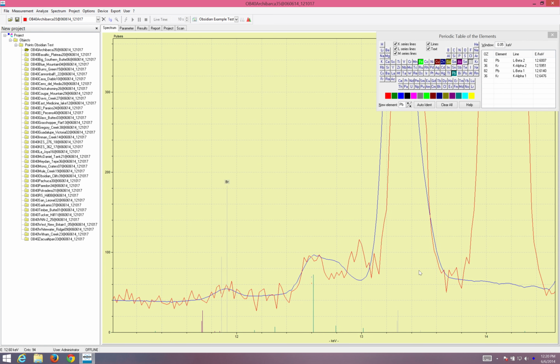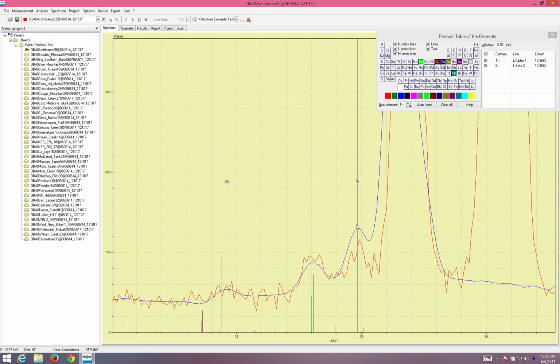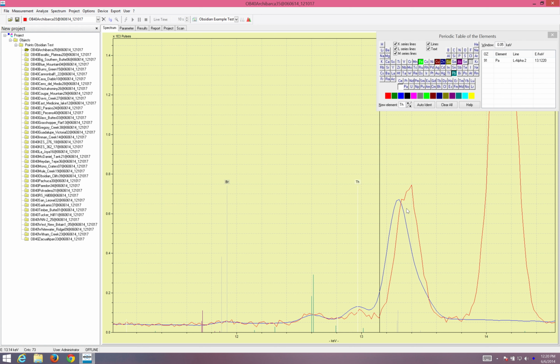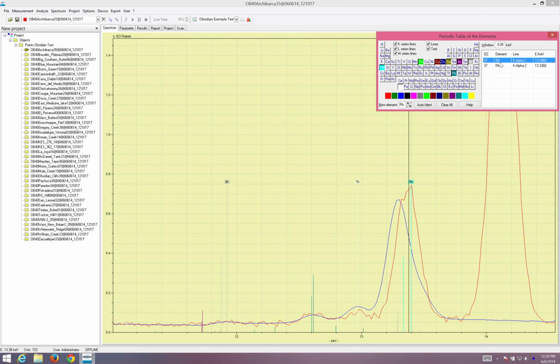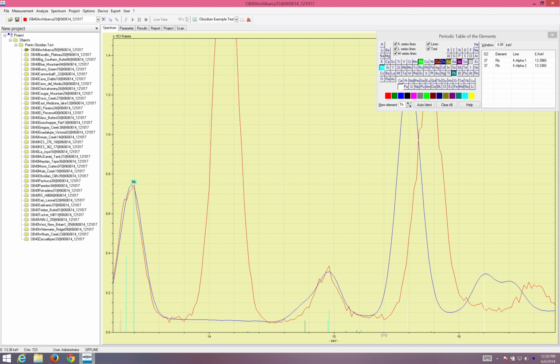But I still have another peak over here. I select here, perhaps this is thorium. Now I'm very far off. If I see over here, these peaks don't match. I select this mismatch, and I see that this could be rubidium. If I run the deconvolution, now things fit much better. Lead, bromine, thorium, and rubidium all broadly agree with the spectrum I'm looking at.